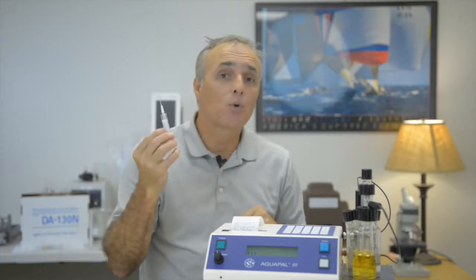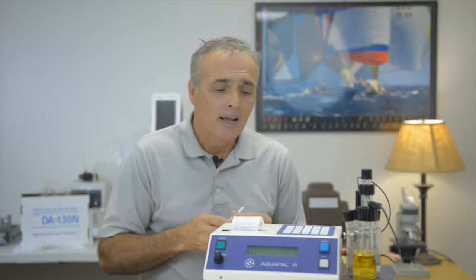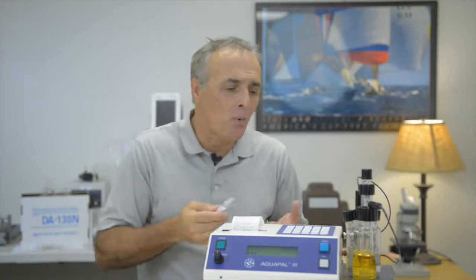Specific gravity is another way for us to find weight. It's based on density. If we think about water, the specific gravity of water at 4 degrees C is 1, at that point 1 milliliter of a sample is equal to 1 gram by weight. So if you have a specific gravity of, say, 0.86, the math behind it is basically you're getting a weight for a volume, and in this case 0.86 grams. It's a way of getting a weight of something using a volume rather than a balance. So a lot of organizations use specific gravity because it's one less instrument that they have to have.